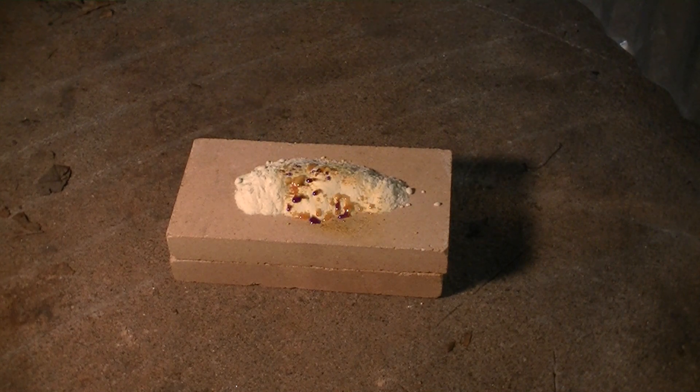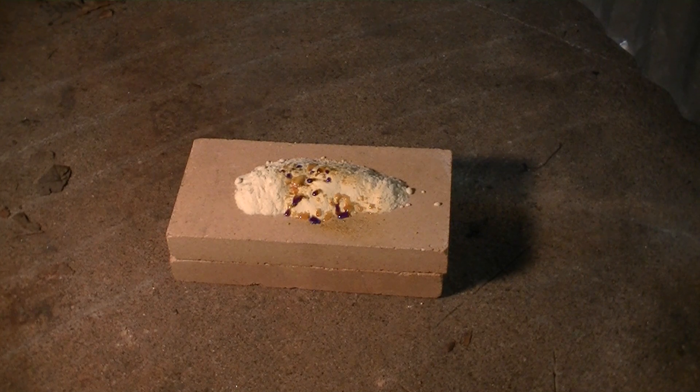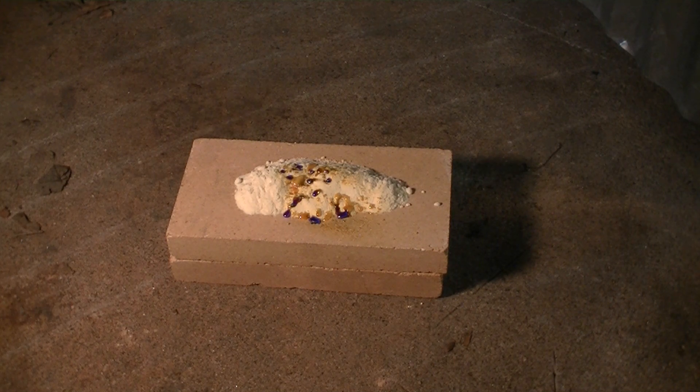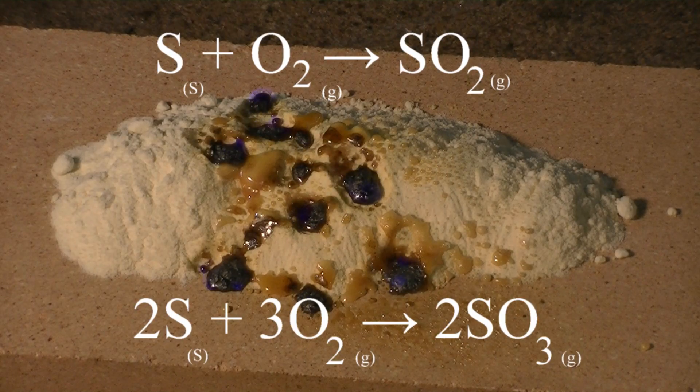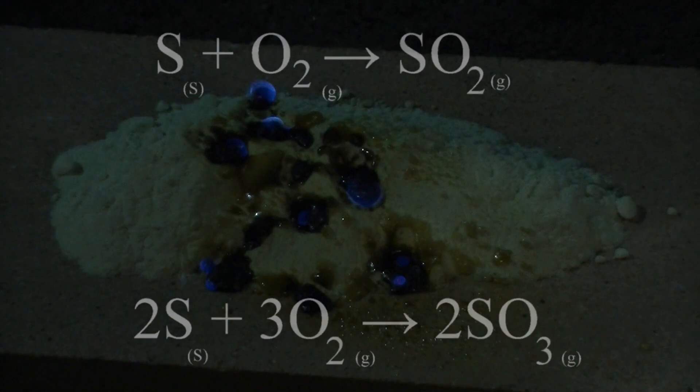We used a blow torch to ignite the sulfur, which easily ignites, and as the sulfur reacts with oxygen the products of combustion are sulfur dioxide and sulfur trioxide. These are very noxious, harmful gases that you do not want to breathe in.